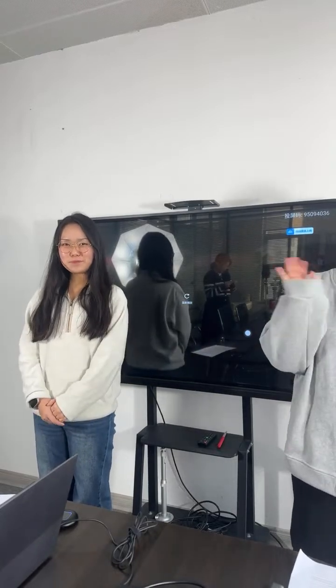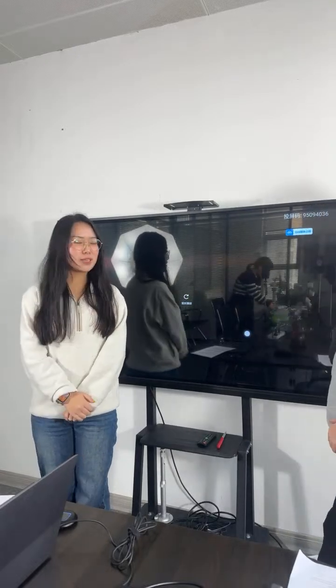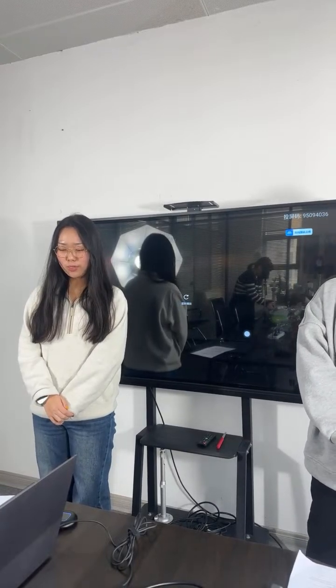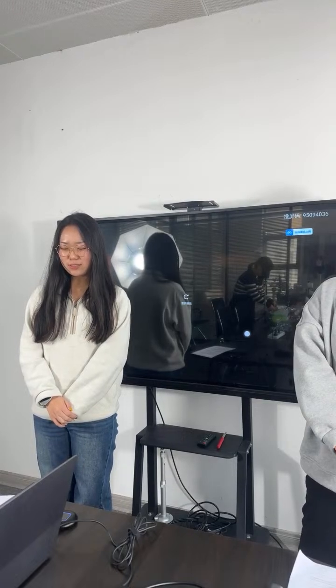Today, we will show you a video about TBN value test. Here's my partner Winnie. Hello everyone, my name is Winnie. This video uses indicator method to test the base number. Hannah, do you know what does base number mean? Yes, base number means the amount of perchloric acid required to titrate 1 gram sample with standard titration solution.